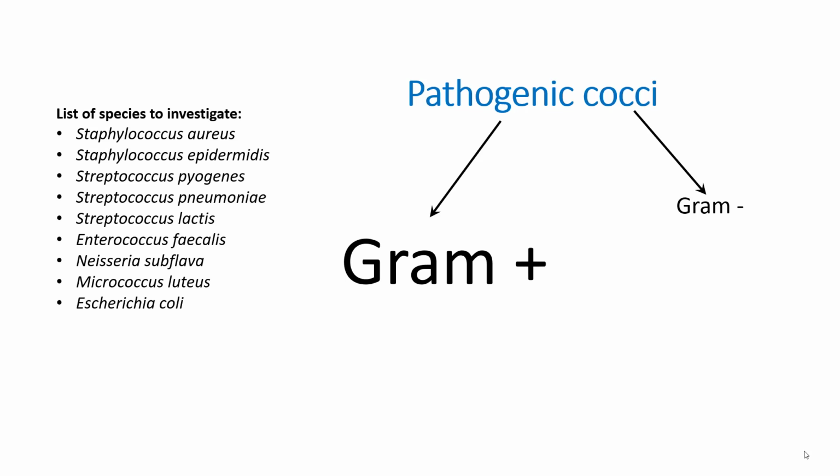Before going any farther, it is highly recommended that you read through the introduction of Lab 27, pause the video while you do so, and then return when you are ready to start on the materials and methods, and be ready to flip forward and record results as they are shown in this video. Again, if this goes too fast, you can always pause or rewind.